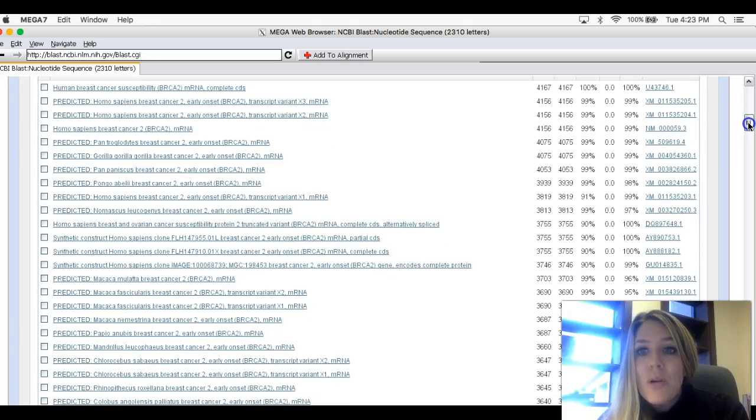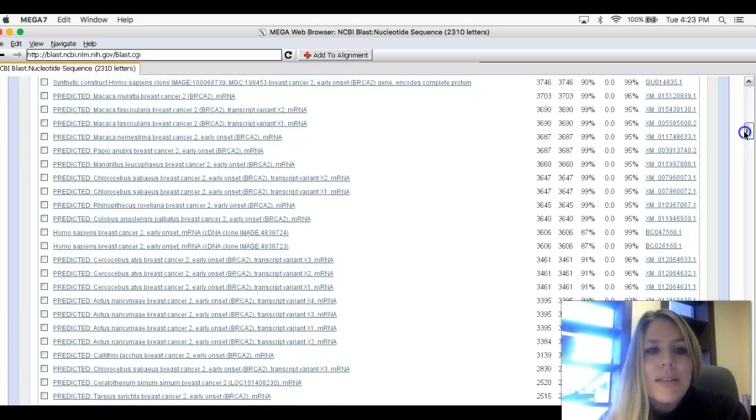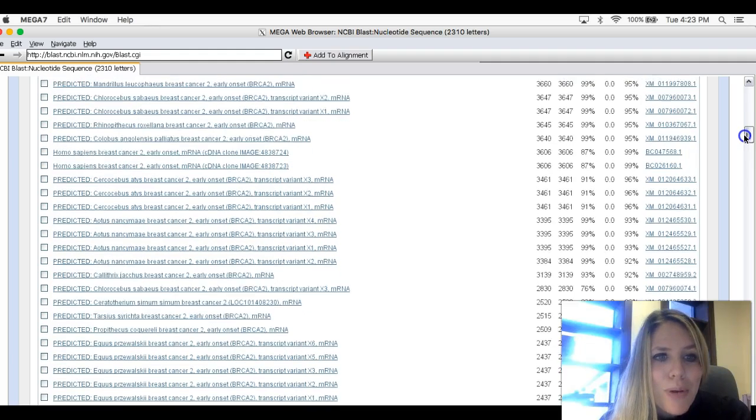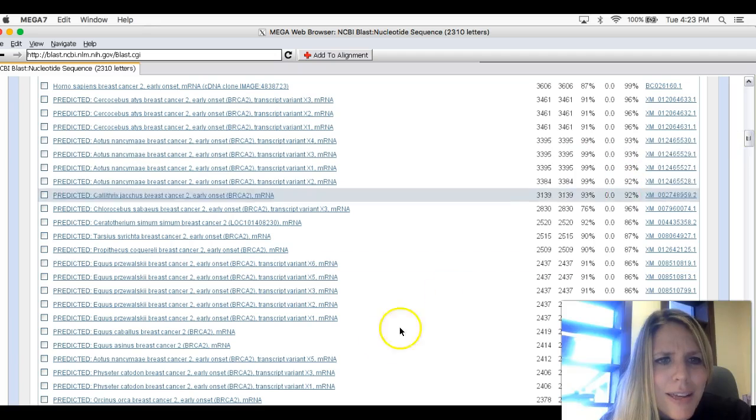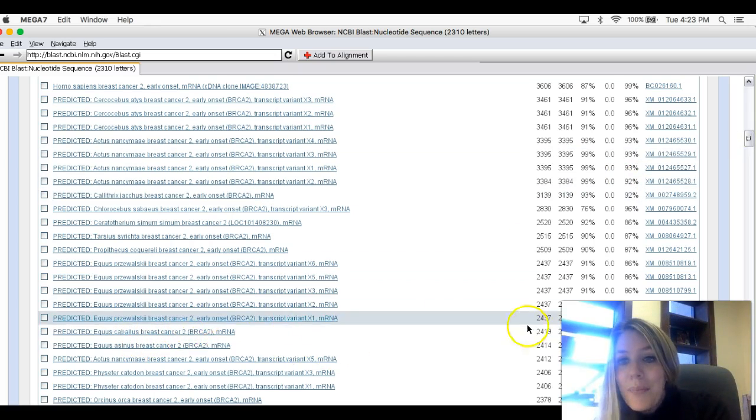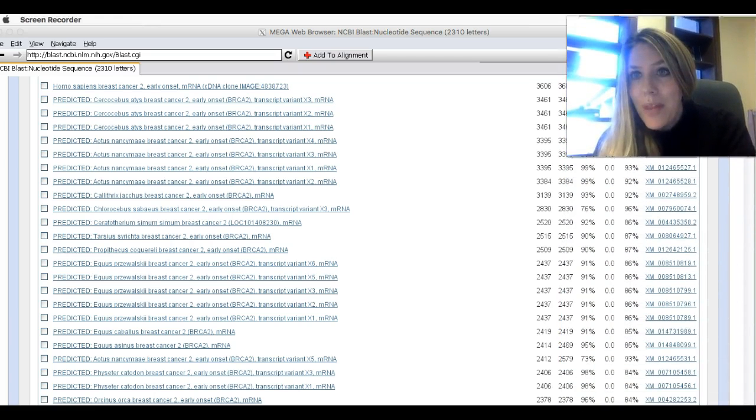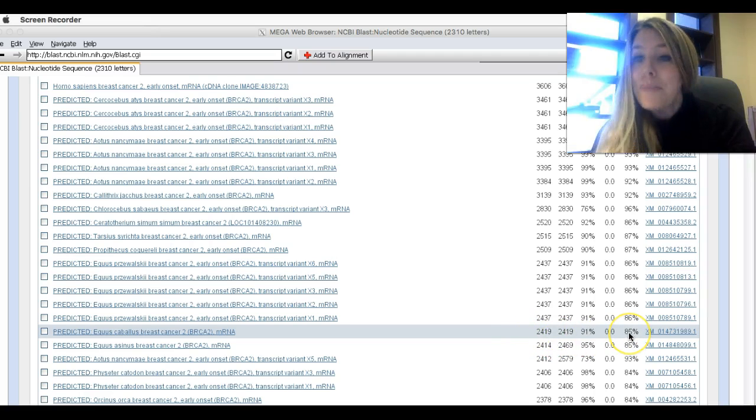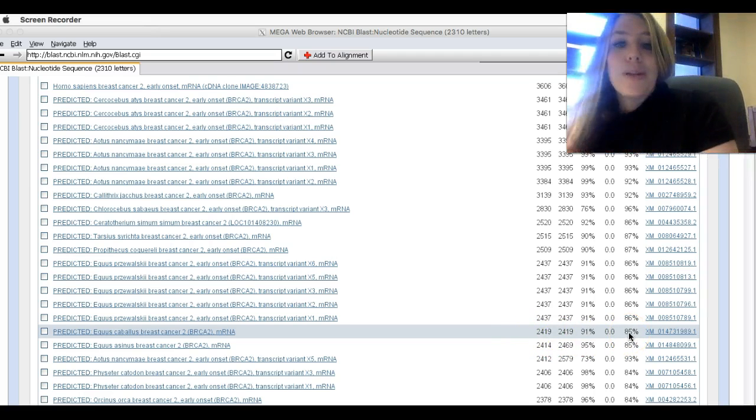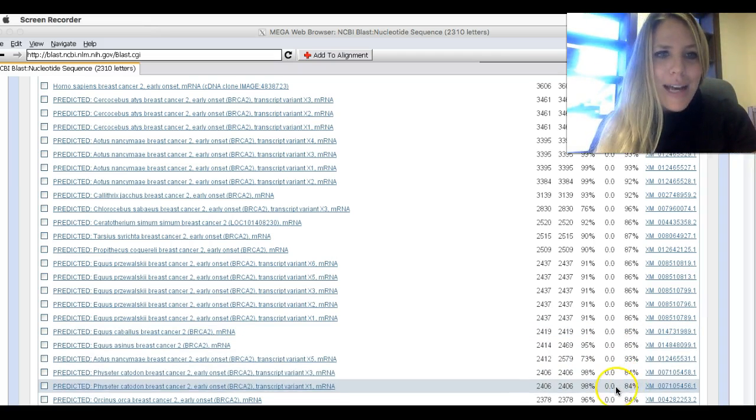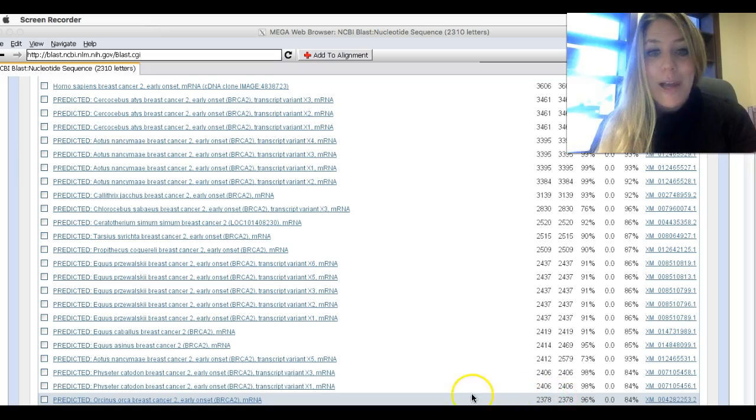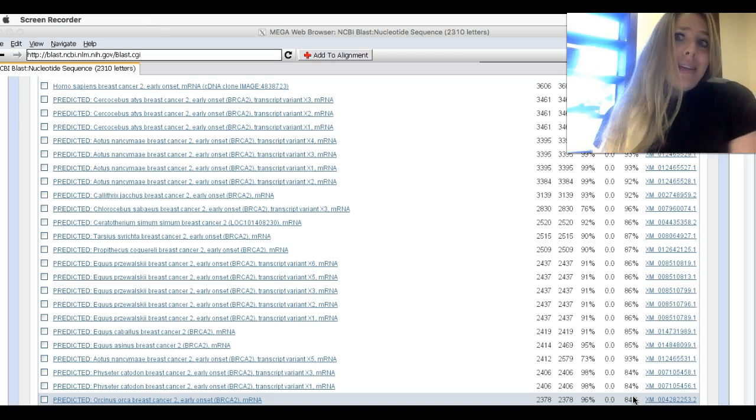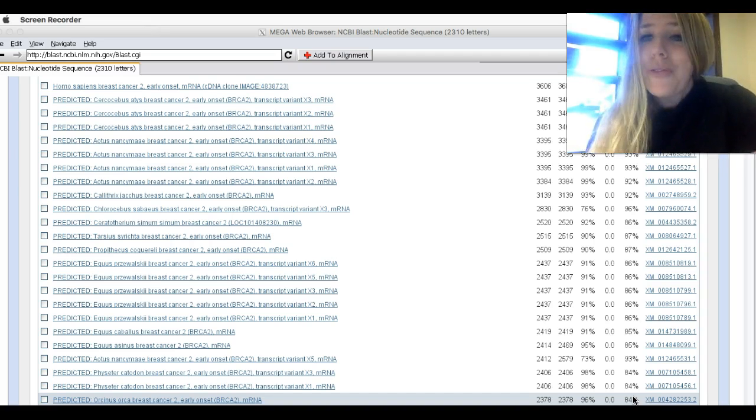But as you scroll down, you'll see that you get to things other than primates. Like, for example, this guy right here, Equus caballus, is a horse. If I move my talking head out of the way, I can see that that horse is 85% genetically identical for this gene to a human. And you go on, and this last one here, I love. This is a killer whale, the black and white killer whales. And he's 84% genetically identical. And he swims in the ocean. He has the gene for breast cancer. Who would have thought it?